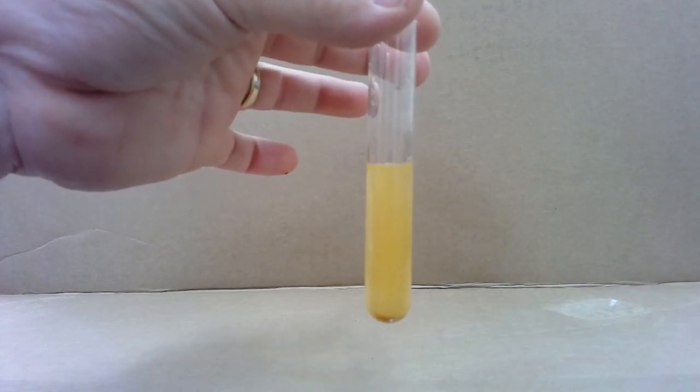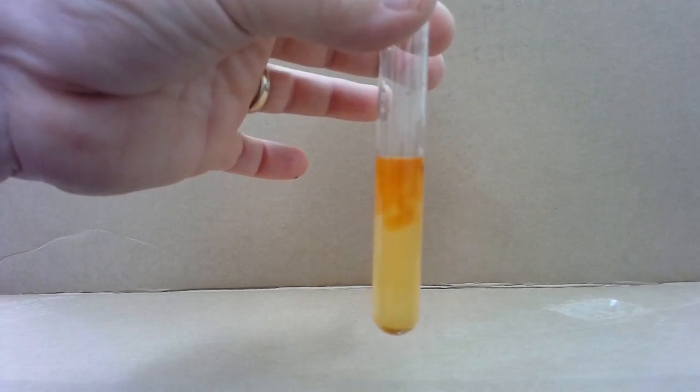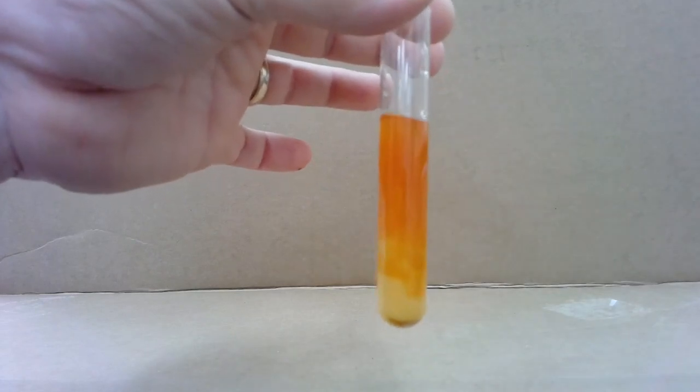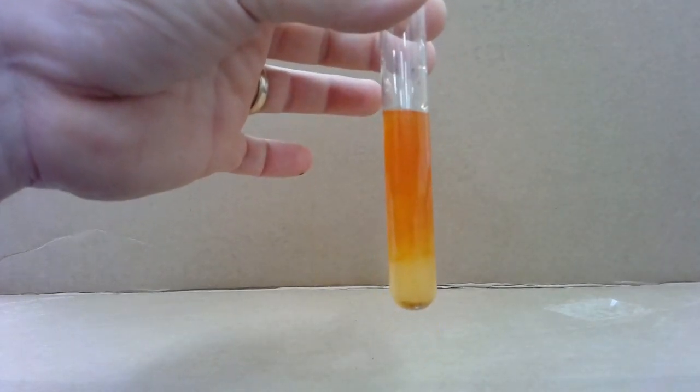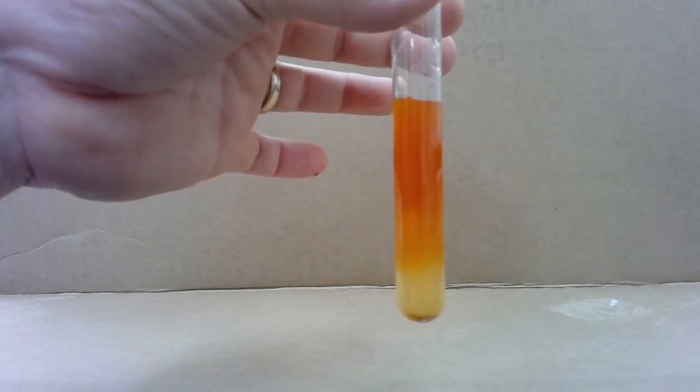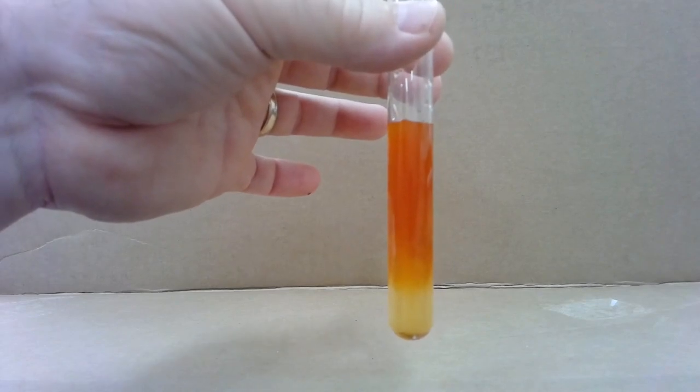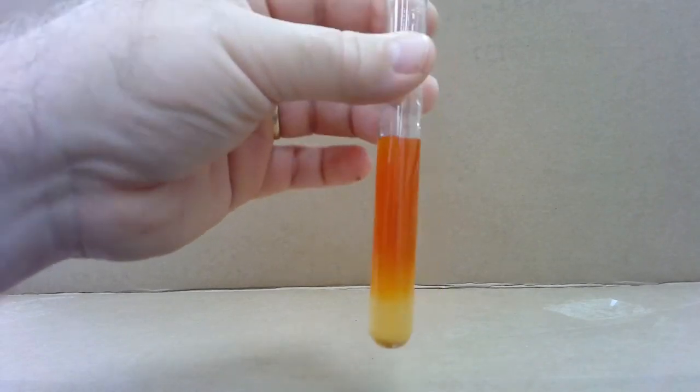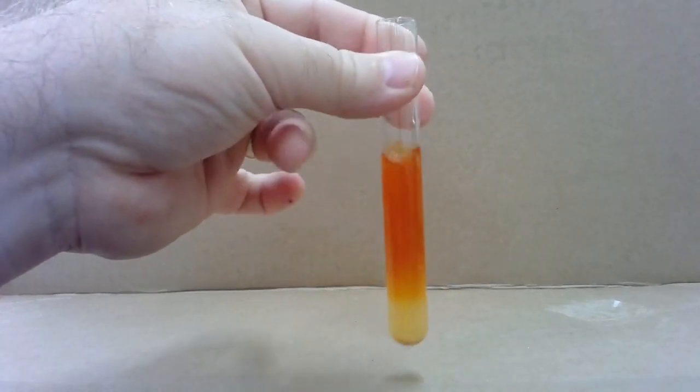But I'm going to add drops of this clear colorless solution to the iron 3 chloride solution. And I hope you can see that it is changing color. It's becoming a redder orange than it was. So the third evidence of chemical reaction would be the unexpected or unusual color change.